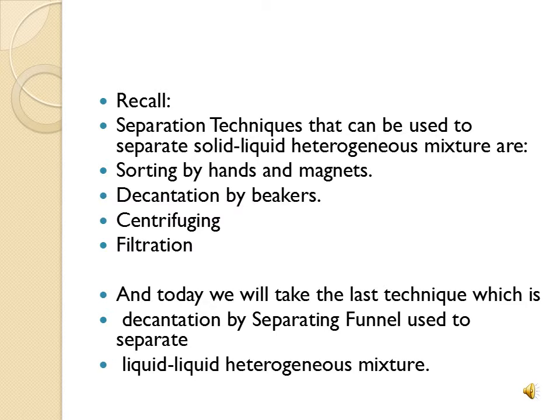To start, let's recall what we took in this lesson about separation techniques. Separation techniques can be used to separate solid-liquid heterogeneous mixtures, only heterogeneous mixtures. Till now we took only heterogeneous mixtures.